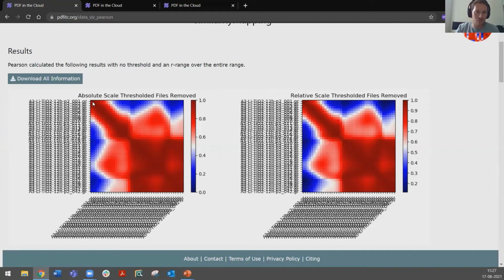However, if we consider the off diagonal, we can see that during the initial discharge, we have some similarity between the first few PDFs. However, quickly, the dissimilarity is pronounced, and indeed, down here it is really pronounced. They are really dissimilar, as observed in the waterfall plot.